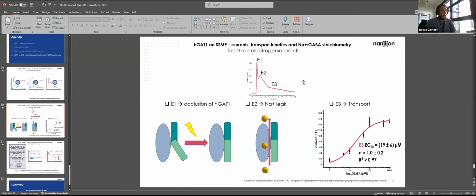And in a way, the analogy I would make, Rocco, is with gating currents. So you could use patch clamp to measure, for example, for a voltage-dependent ion channel, the current, but you can also look at gating currents that would look at the conformational change that occurs when the voltage change is imposed. So I gather, would that be a valid analogy?